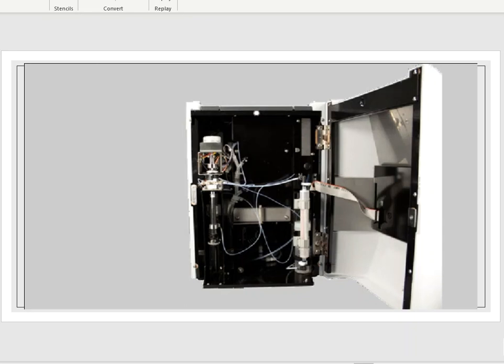Okay, so where's this halogen scrubber? Well, we talked about in the schematic where it is, but where is it in the instrument? Because this is a piece that has to be exchanged, maybe depending on your samples, on a regular basis, the halogen scrubber has to kind of be upfront and personal with you.